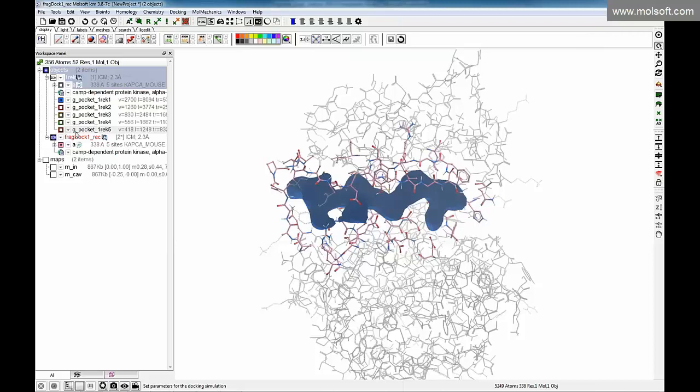And you can see now it's set up, we also have an additional object in the ICM workspace called fragdoc1_rec. So this is the object we're going to actually dock to now. You have the original file, and now we have this receptor here shown in red.